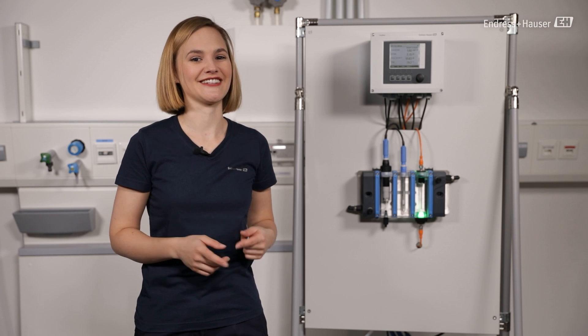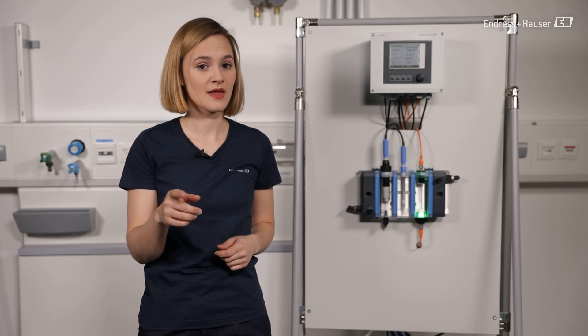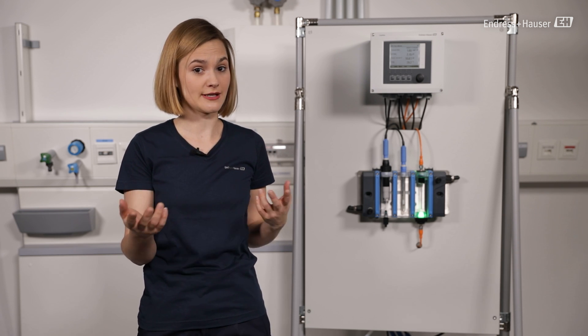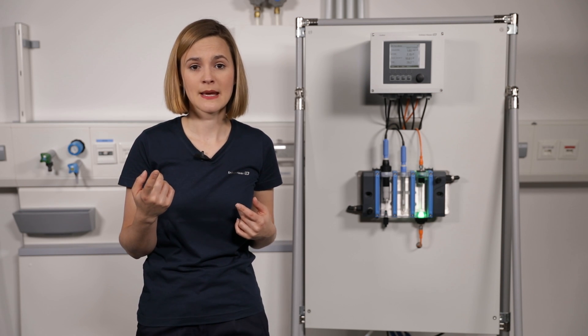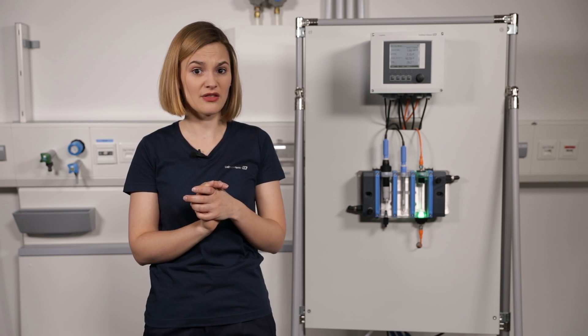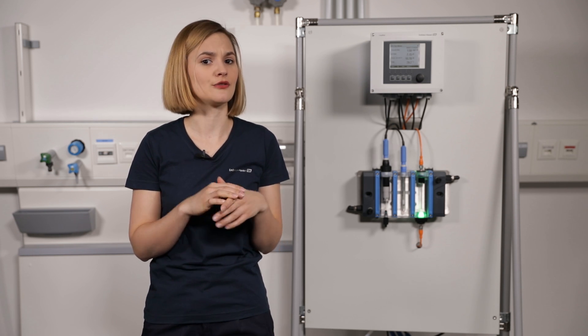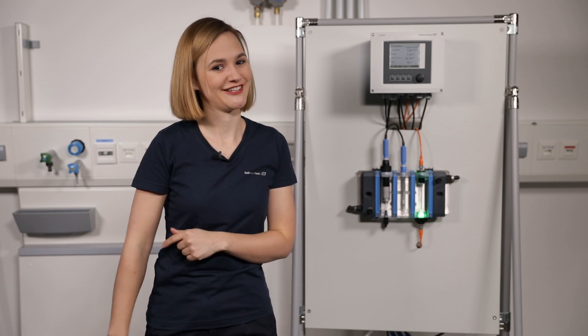Hey, do you have a digital free chlorine sensor Memosens CCS51D in your disinfection process? Then you probably want to calibrate it someday, at least once a year after maintenance. But you're not really sure how to perform the DPD reference method correctly? Don't worry — you have found exactly the right video.